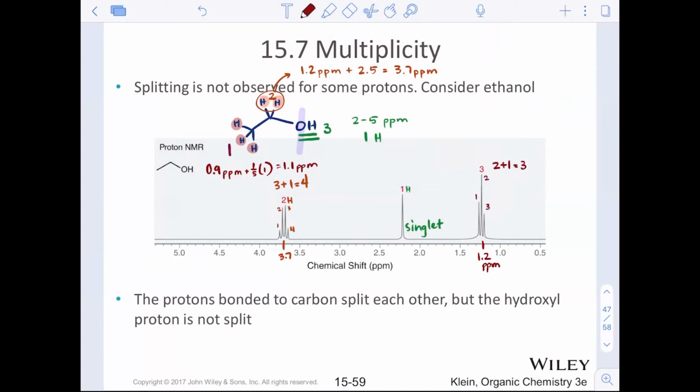Excellent. Now we can dissect not only how many sets of hydrogens we see, how many signals, we know where they appear, their chemical shift, we know their integration values and assess how many protons are represented there from the computer data. We also can predict the splitting pattern.